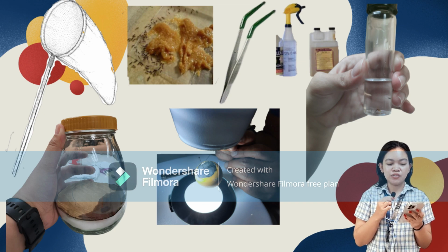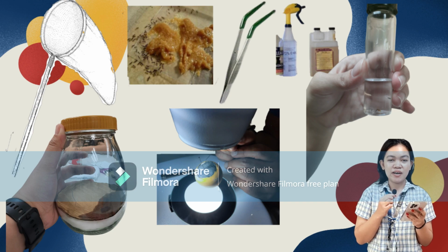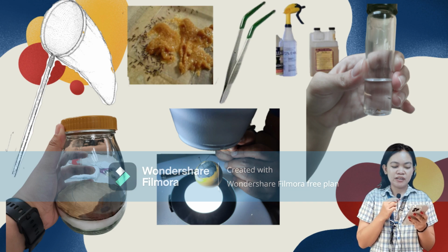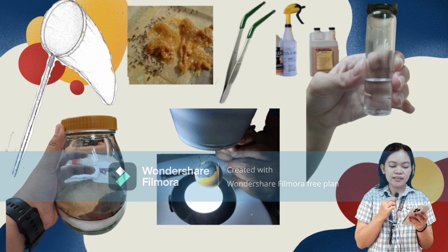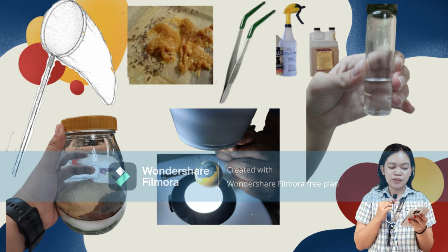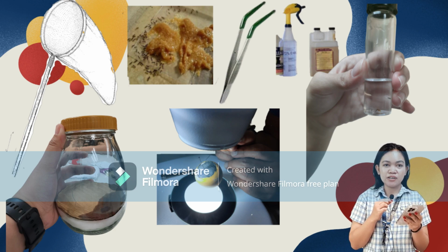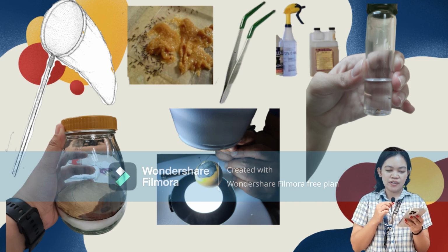Next is absorbent tissue to prevent moisture damage in killing bottles and aspirators. Next are a notebook and writing equipment for recording collection data. Next are a knife and scissors used for specimen and label preparation, and a small brush for handling minute specimens. Next are collecting nets used to capture arthropods, killing jars or bottles, containers for quick euthanization, and liquid killing agents, jars or containers with liquid agent for arthropods, and baits and other attractants, substances to attract arthropods for collection.